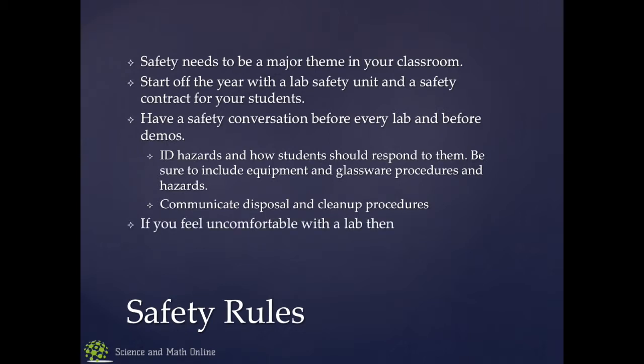If you feel uncomfortable with a lab, do it as a demo. Bring that risk to you. If you're not comfortable with the kids doing it, don't let them do it. If you are really, really uncomfortable with something, that's usually a good sign that you don't need to do it. Okay? Kind of along those lines, never let kids do a lab you haven't done yourself first.